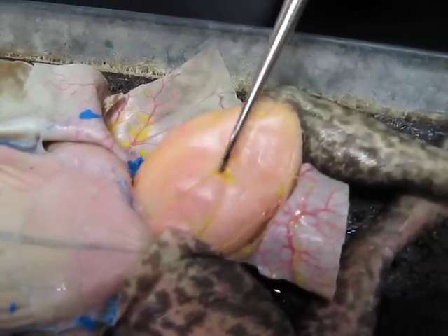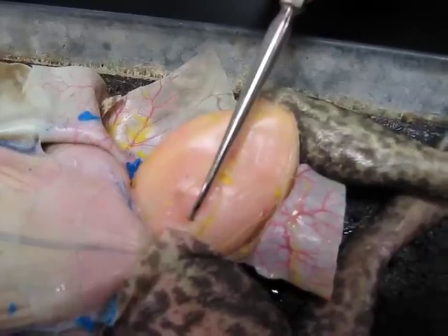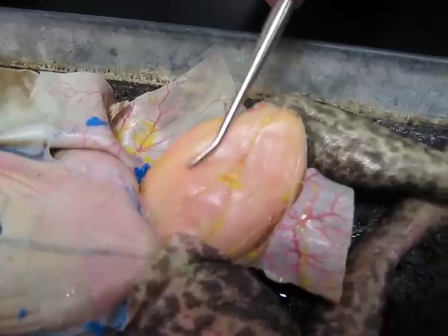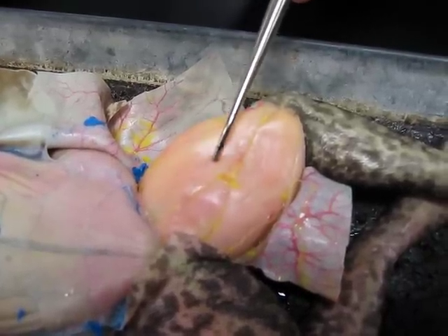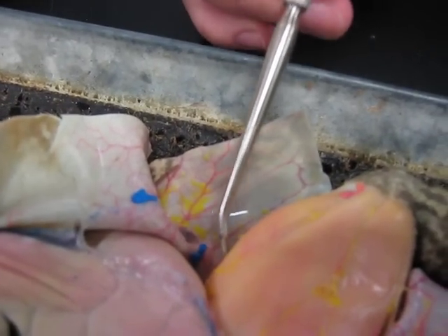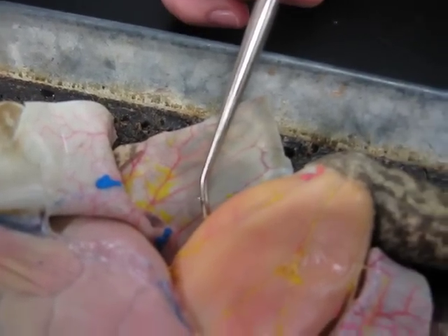This V structure right here, this muscle, is the adductor magnus. Up above that, from here to here, is the sartorius. And up above that, on this upper side, is the triceps femoris. And that is the leg.